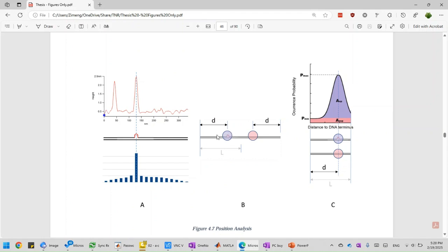But if the protein is big, like with multiple proteins inside this huge protein complex, now you have inaccuracy, right? So the peak of the protein could be anywhere inside this protein complex. It could be from the left edge to the right edge. So the peak of the protein complex does not correspond to the location of the slip out. So that leads to inaccuracy, right? So we will not know whether it exactly binds to this specific site or not.